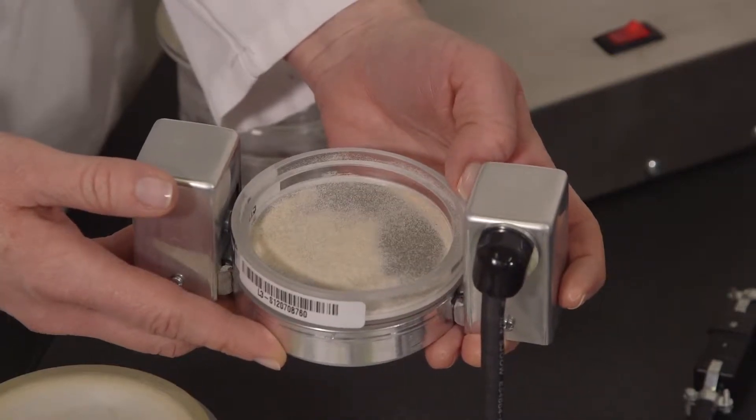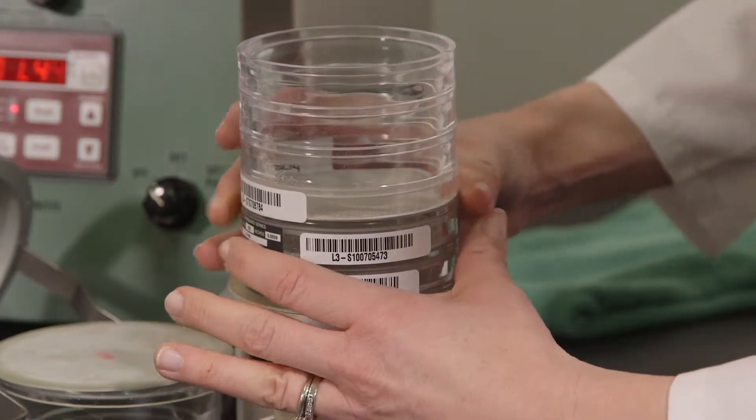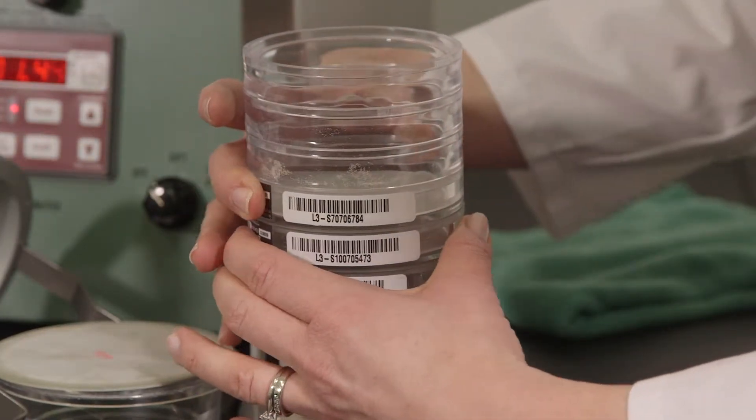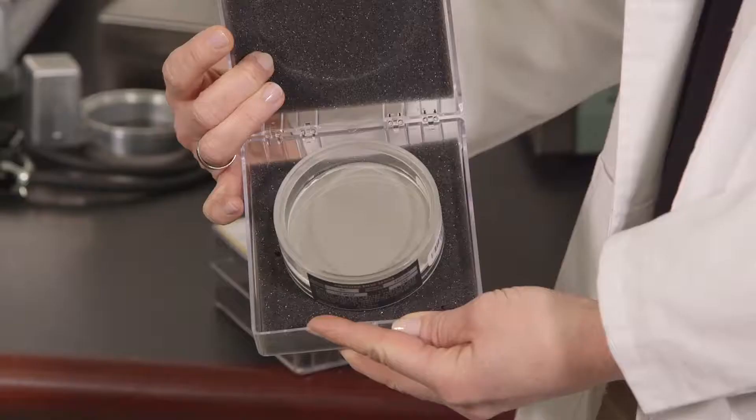When working with samples finer than 45 microns, you may find the addition of the L3N8 horizontal pulse accessory helpful in reducing agglomeration. This accessory is placed at the very bottom of the stack, on top of the fines collector, and will impart a horizontal tap to alternating sides of the stack.